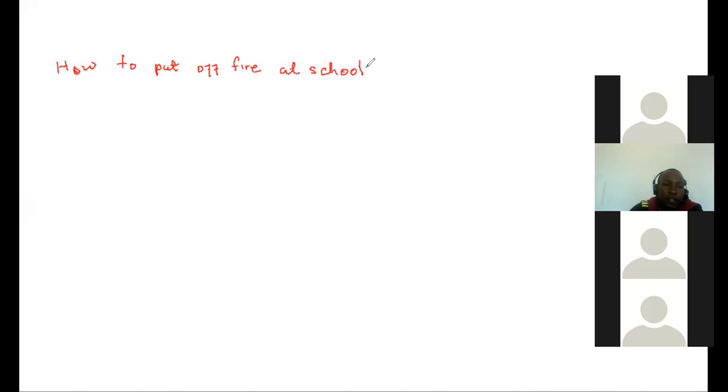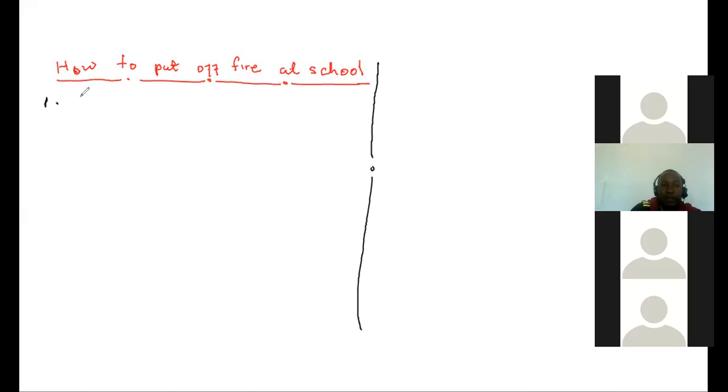So at your school, SS Mukono, how can we put off fire when we are in the school lab? Okay, I expect you to follow the following steps such that your mission becomes successful. Step number 1, I expect you to put on fire resistant attire.